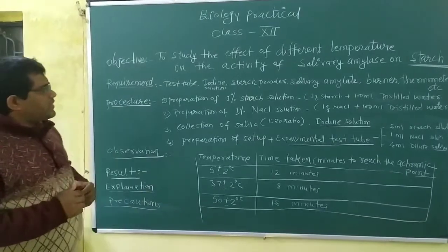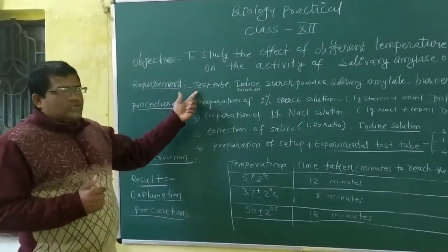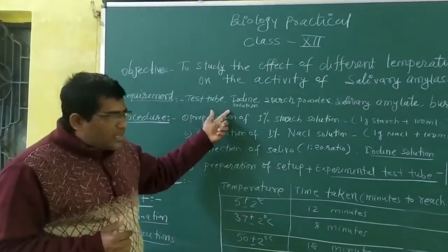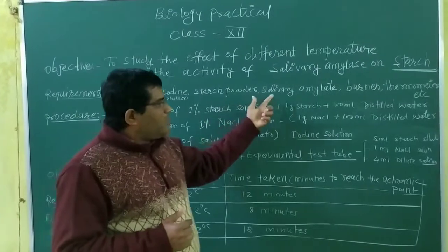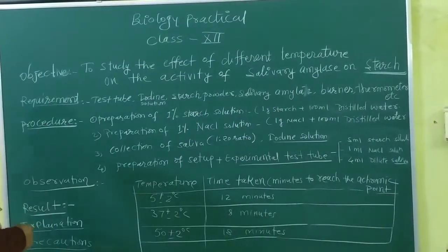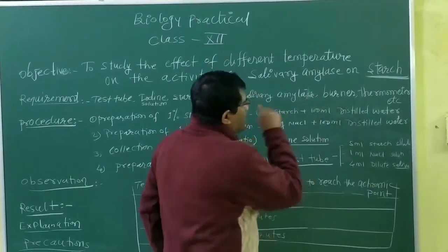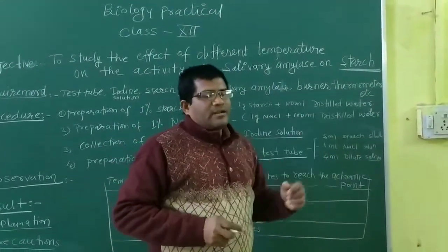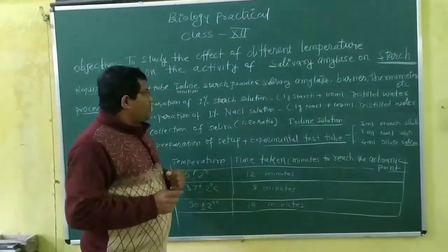So for this experiment, our basic requirement: test tube, iodine solution, starch powder, salivary amylase, burner, thermometer, etc. So many things we require for this experiment.